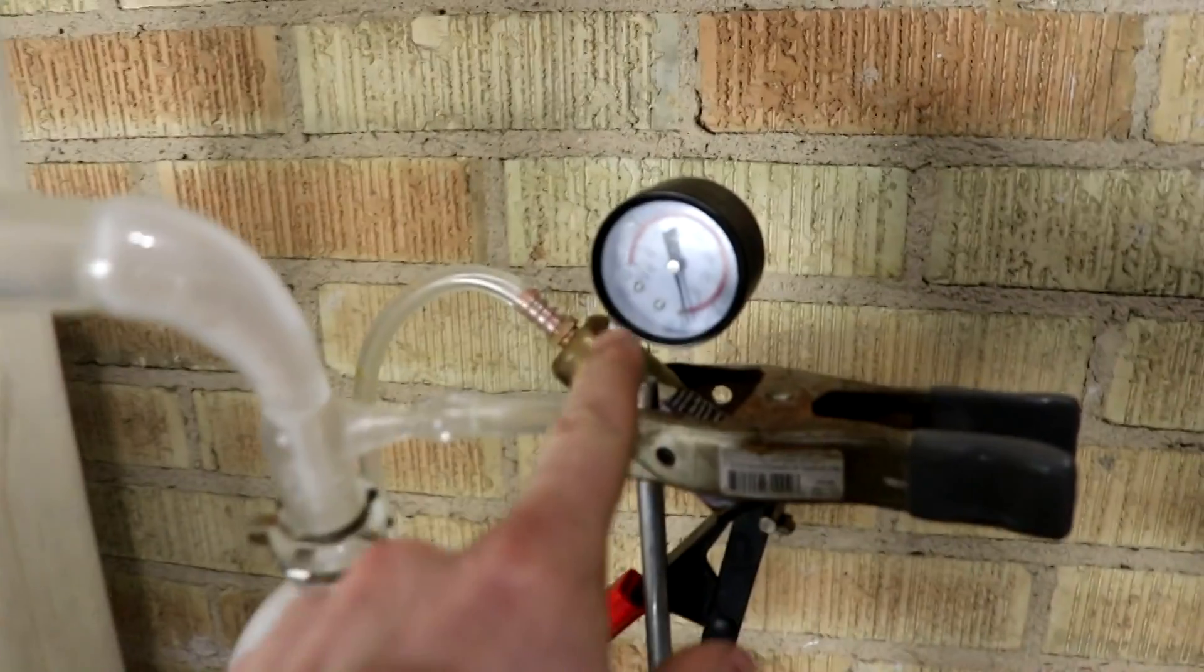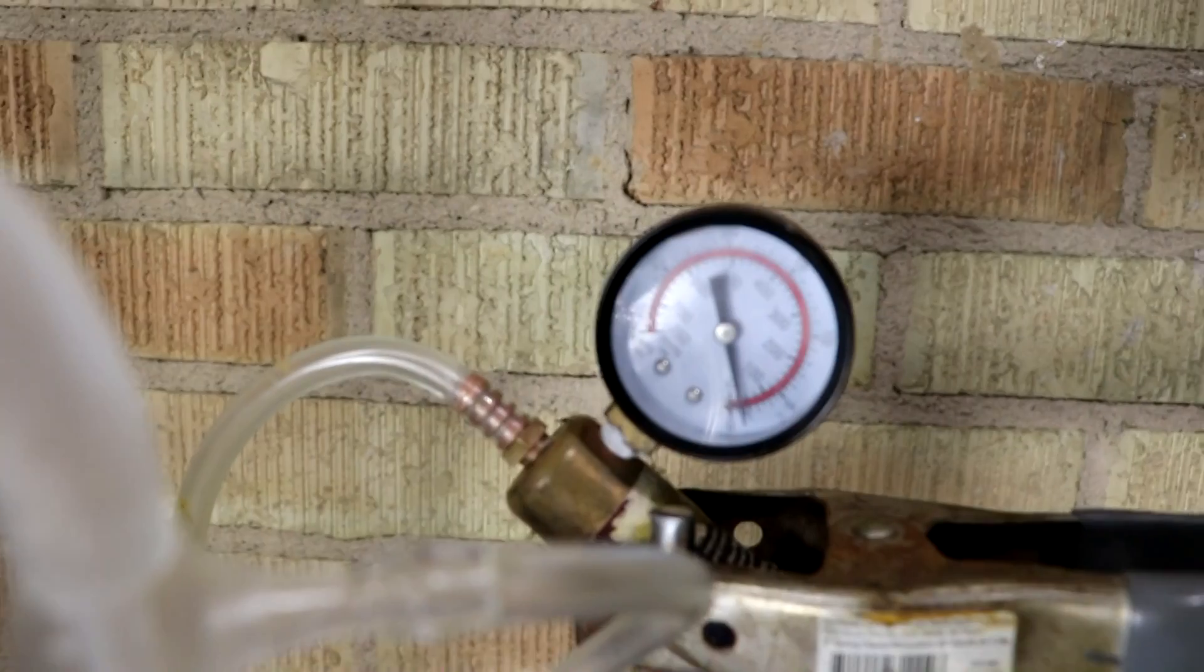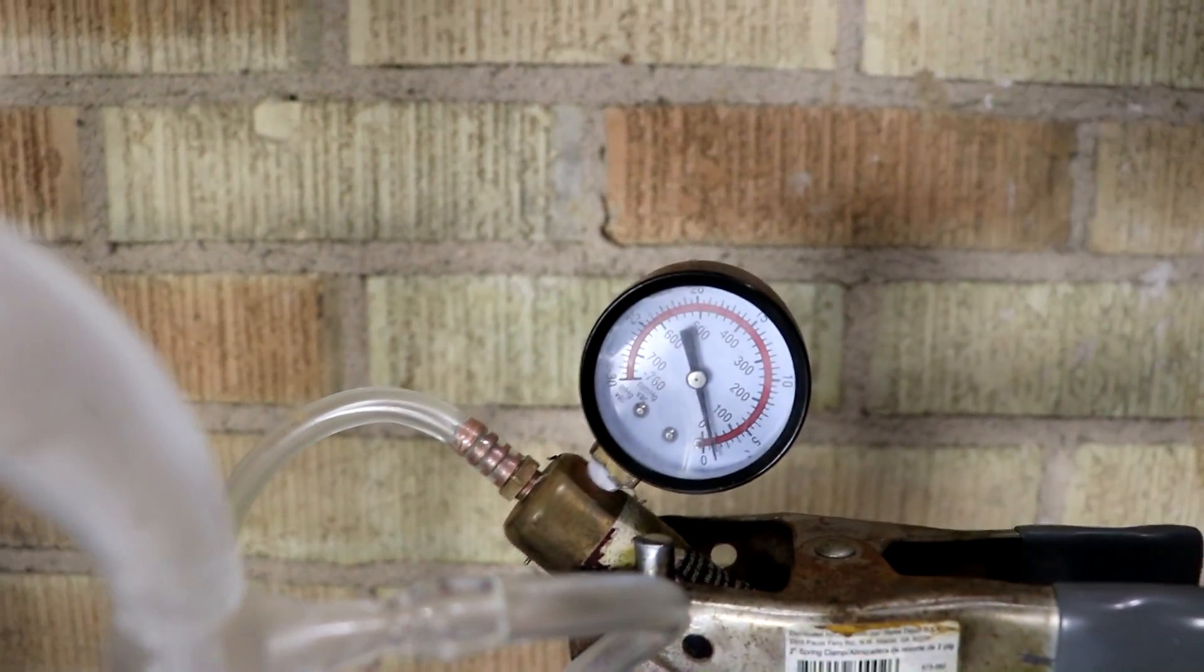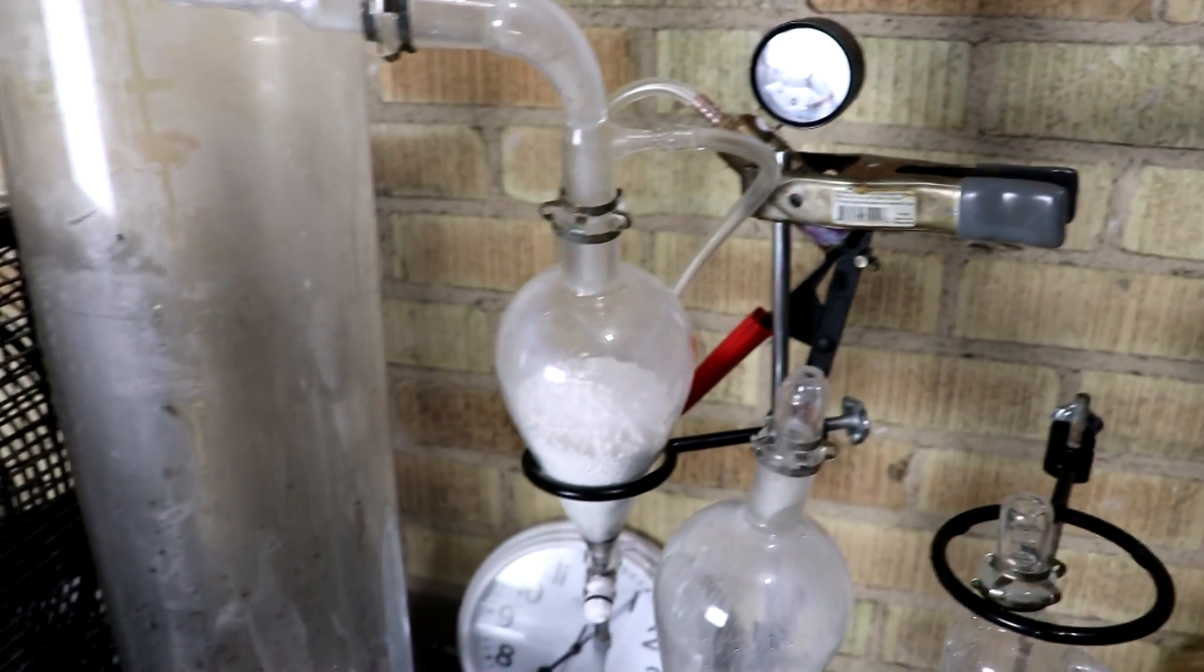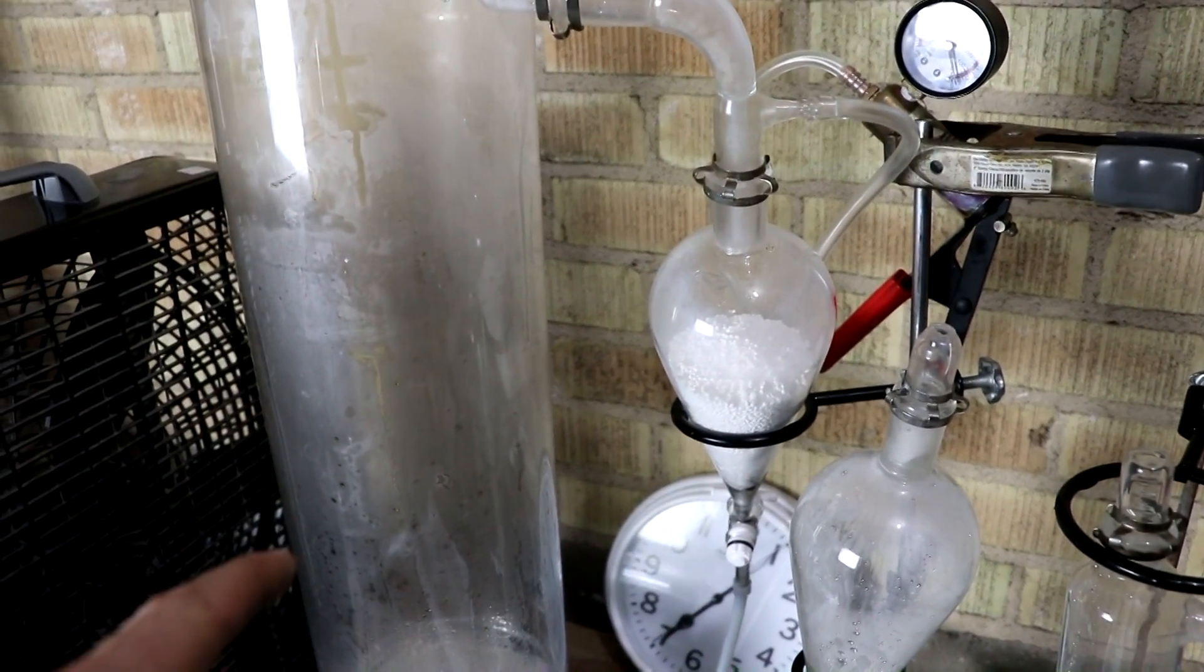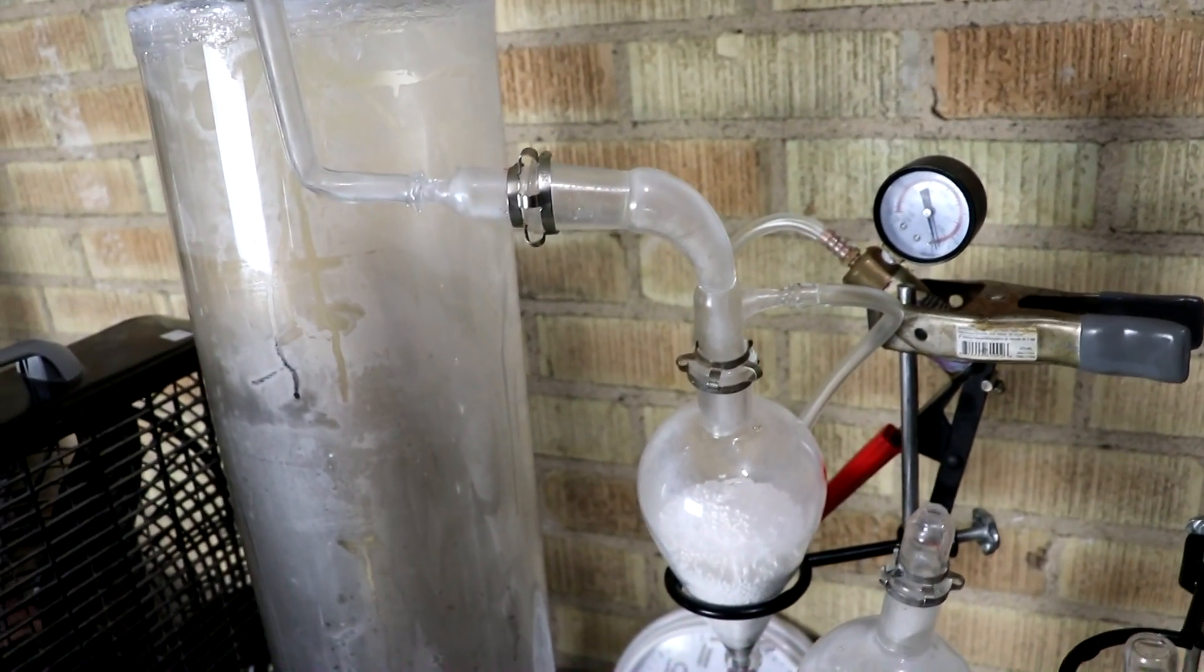This pressure gauge seems to be stuck at about one inch of mercury. You can see here. My guess is that either the reaction's not working, or air is leaking in at about the same rate as the other gases are consumed.